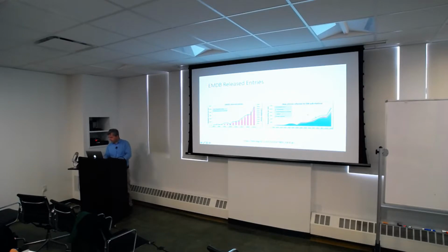But if you look at it by method, the vast majority is single particle. You have a little bit of helical, a little more subtomogram averaging, and then just straight tomography. And then crystallography is still a very, very tiny part of the total EM structures being solved. So there aren't that many people doing it, but it is a potentially interesting technique. Certainly, if you do have crystals of something that don't diffract very well, this might be more interesting for you.